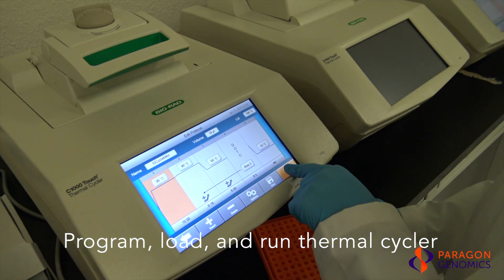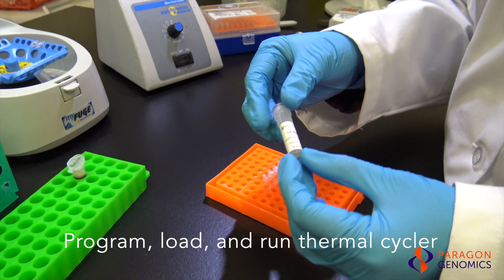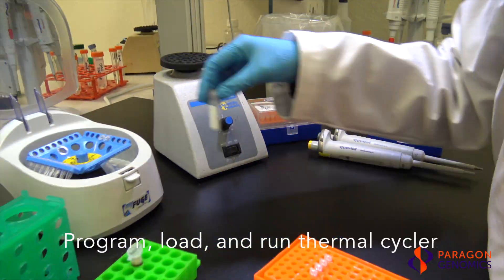Once the multiplex PCR reaction is completed, quickly spin down the samples. Also, vortex and quickly spin down the TE buffer.